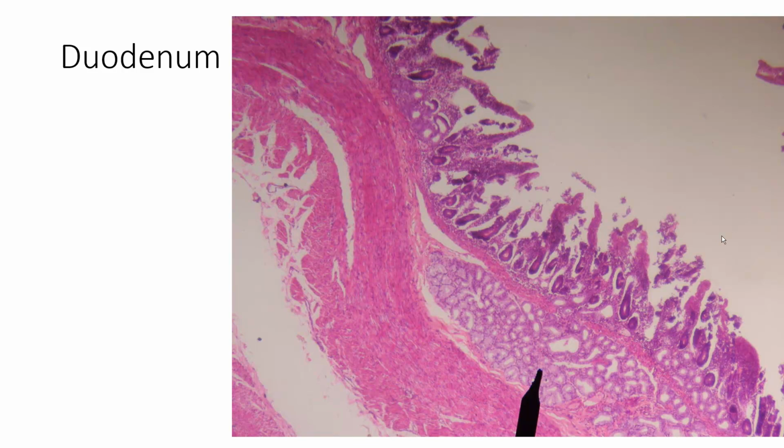The duodenum, you can see in this micrograph, has villi. So here are our villi poking up. It's down in the submucosa, however, that we see kind of the defining feature, the thing that lets you identify this as duodenum and not some other part of the small intestine. And that is these coiled tubular glands visible here at the end of the microscope's pointer. And these are called Brunner's glands.